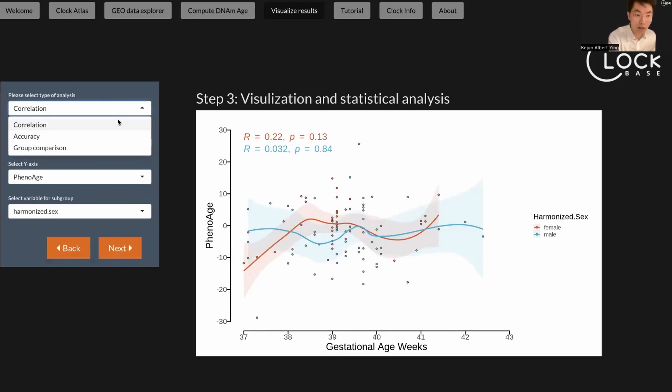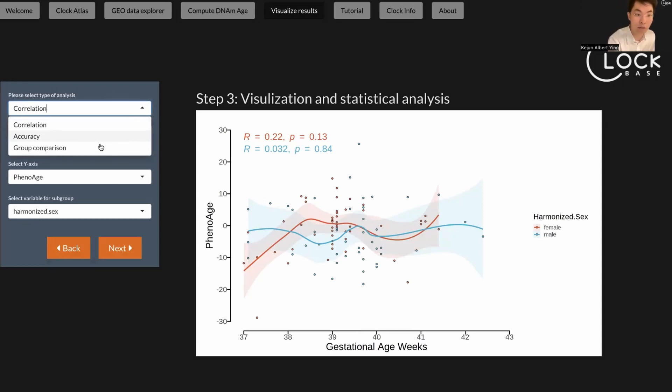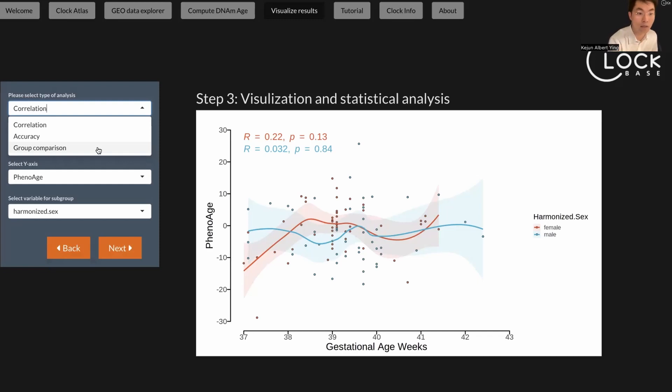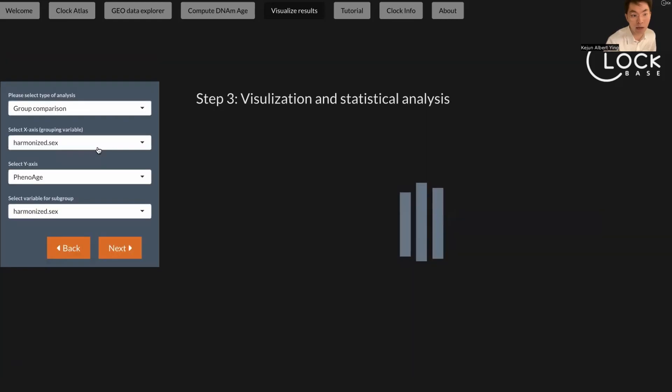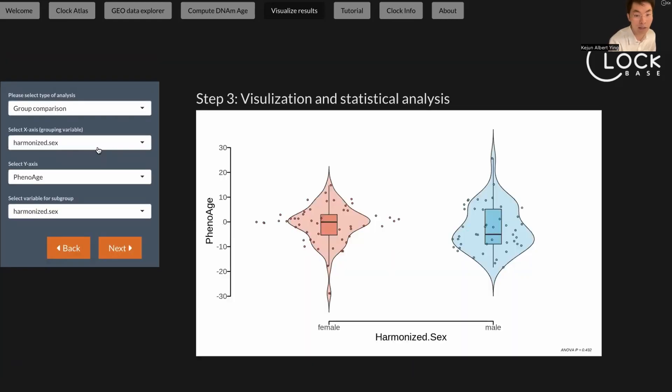Besides correlation, you can also look at accuracy, which since we don't have an age column here, this doesn't make sense to look at accuracy of the clock. But another, I think the most important analysis here for most people is the group comparison. Here you click the group comparison. It will change the UI and you can select what comparison you want to make. For example, here the default is comparing by sex.